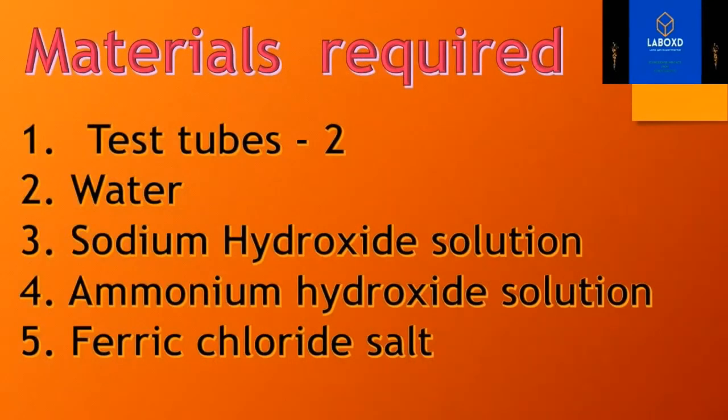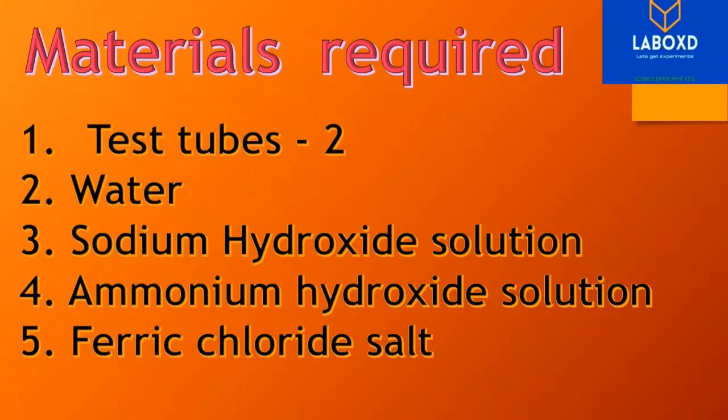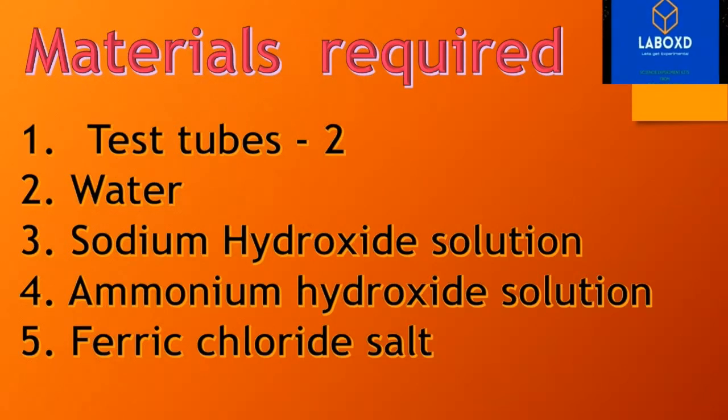The materials required for this experiment are 2 test tubes, water, sodium hydroxide solution, ammonium hydroxide solution, ferric chloride salt.